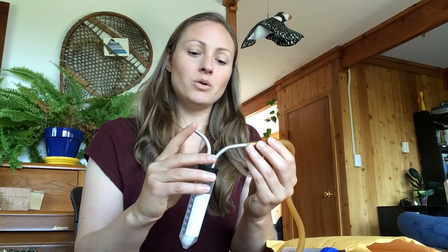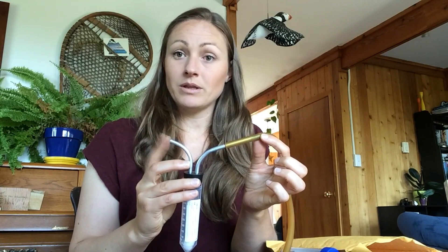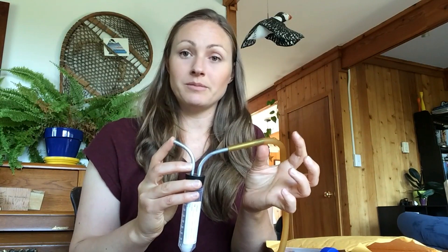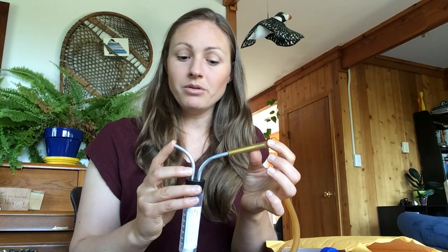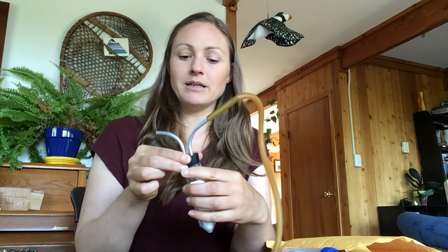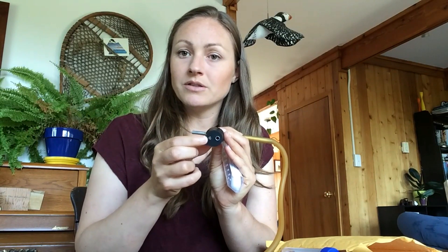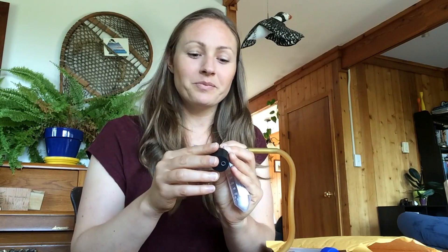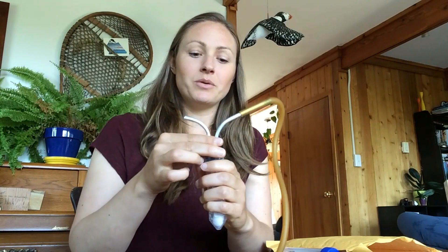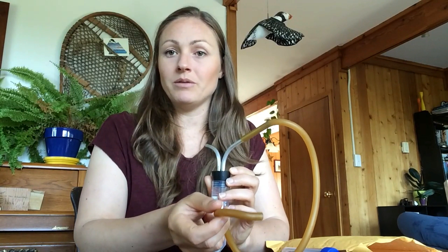You'll notice there are two lengths of straws here. One of them is the one that you suck onto and the other one is where the mosquito sample goes into. The shorter one is the one that you put to your mouth. But if you're unsure or you forget, go ahead and just look underneath — the one that has the screen on it is the one that you suck in, so that you can't inhale the mosquito sample. So that's another way of checking as well.